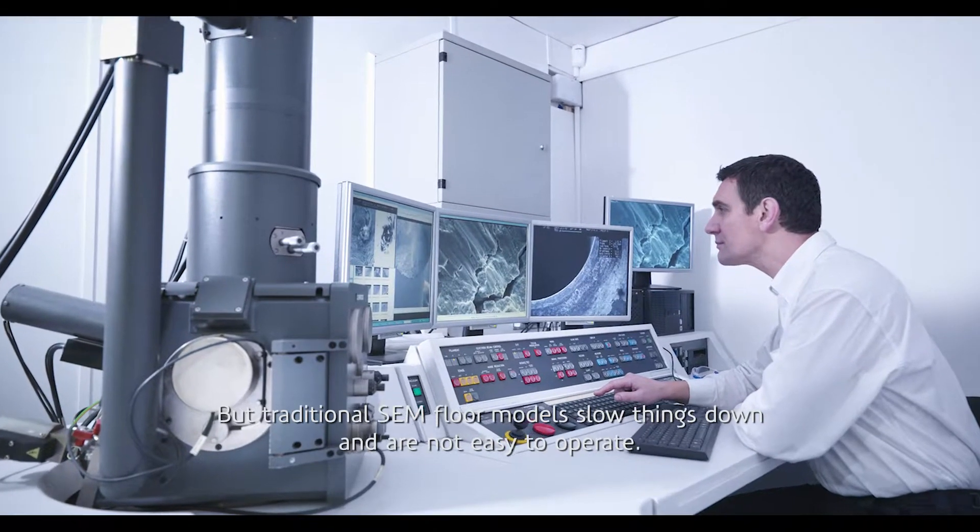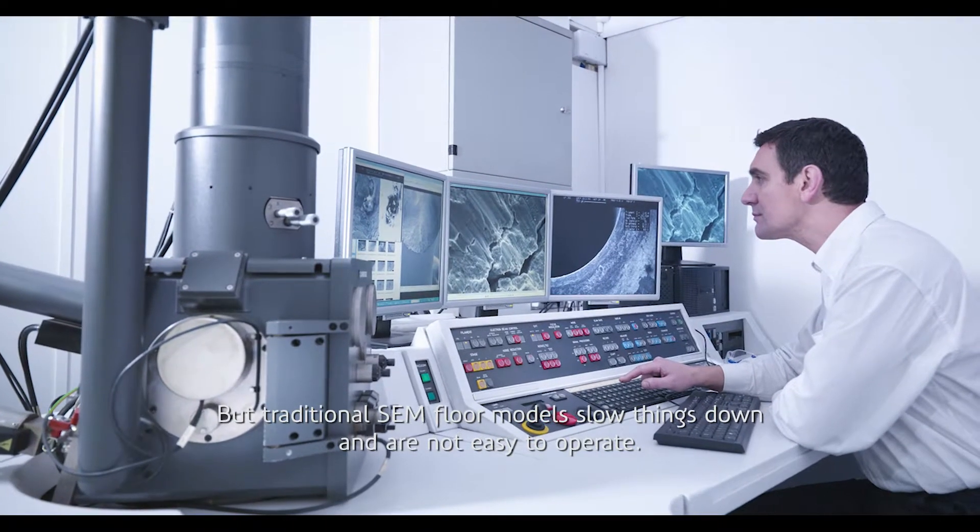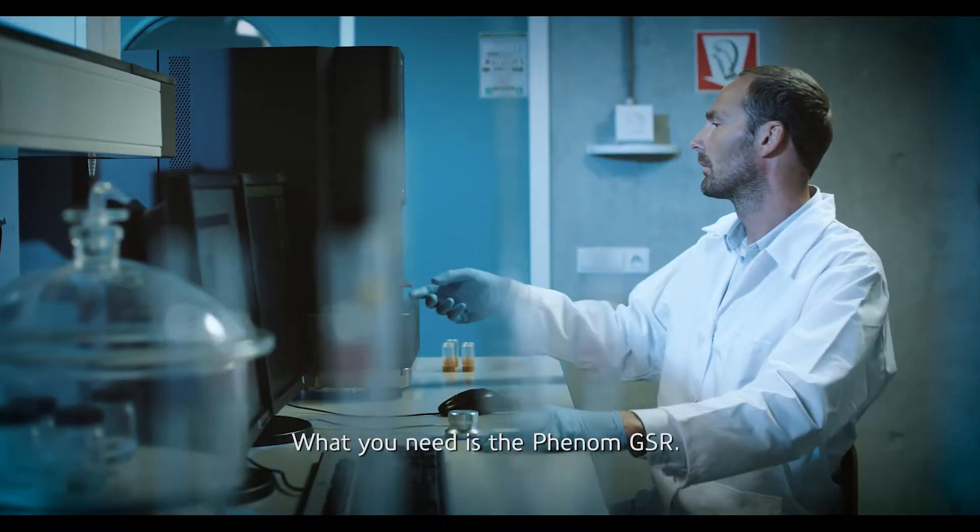But traditional SEM floor models slow things down and are not easy to operate. What you need is the Phenom GSR.